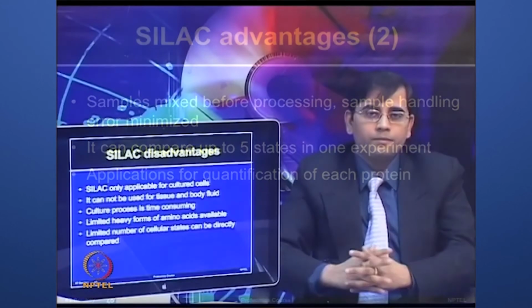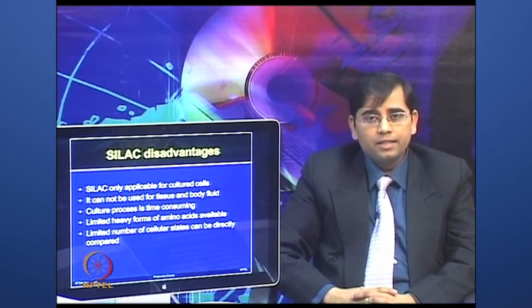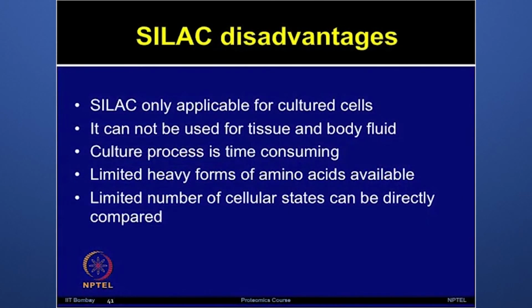Although there are many advantages of using SILAC, there are some disadvantages due to the inherent nature of this method. SILAC is applicable for only cultured cells. It cannot be used for tissue or body fluids. So, that is one of the major limitations of this method. The tissue culture process is always very time consuming and it requires very meticulous and efficient work.